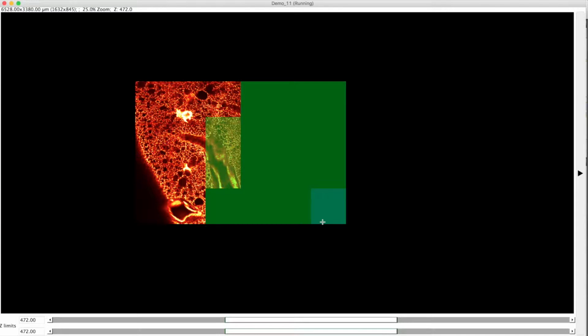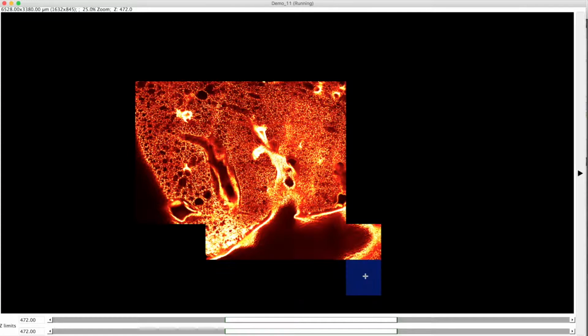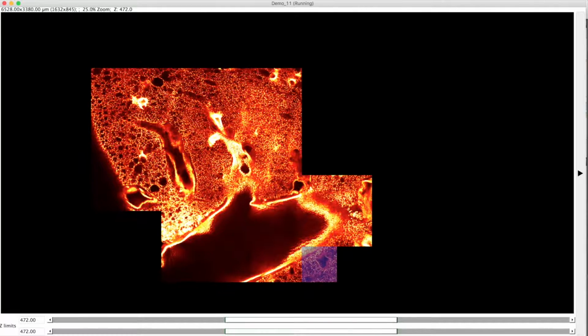The goal here is to rapidly locate the airway branch points within the lung so that we can image them at higher resolution. First, we explore a 2D slice and find the largest airway within the lung. Holding both mouse buttons and dragging pans around the image.